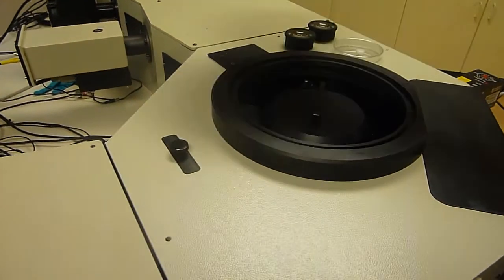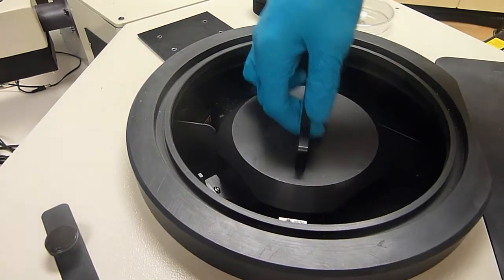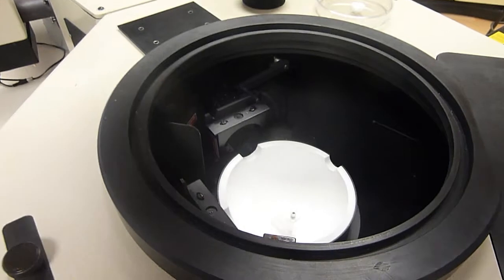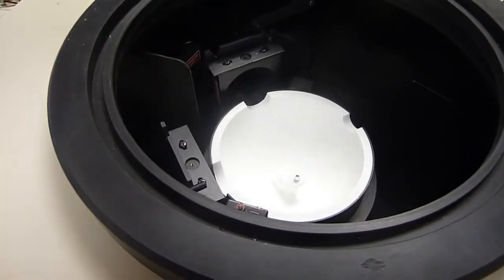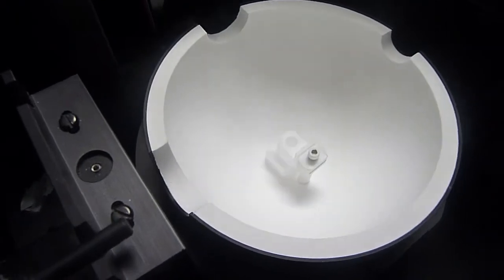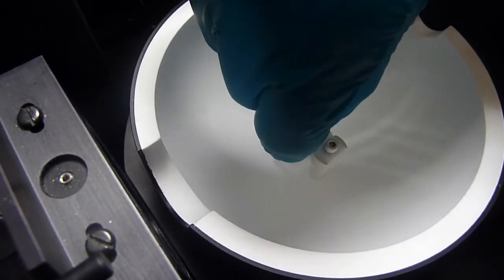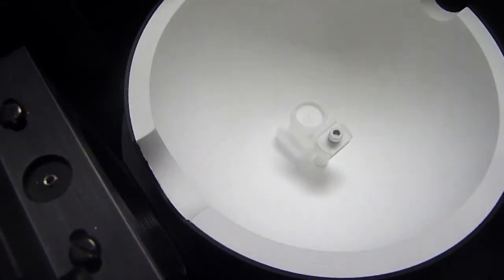Within the sample chamber here I have the integrating sphere and I can just lift up the top of the integrating sphere. And you can see here that I have a little region here where I would input some powders. That's where my powder would go.